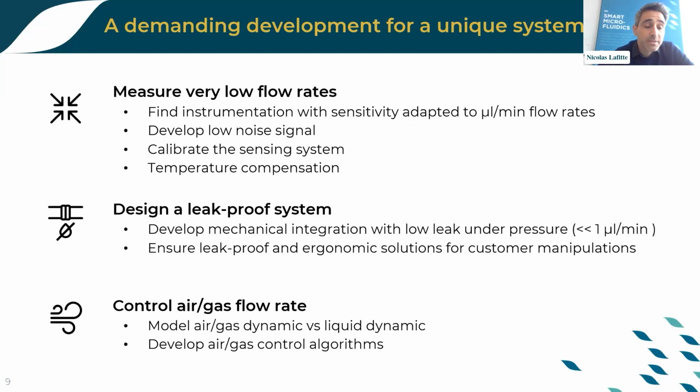Then there's been another big challenge, mainly related to the regulation and the sensing part. Since air and gas do not behave in the same manner, the dynamics are not the same for air and liquid. Actually, it's easier to deal with liquid than with air.